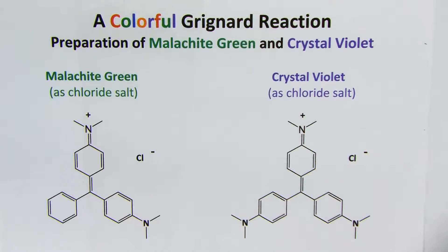Hello everyone. This video will demonstrate how to do a Grignard reaction, a common reaction in your textbook.